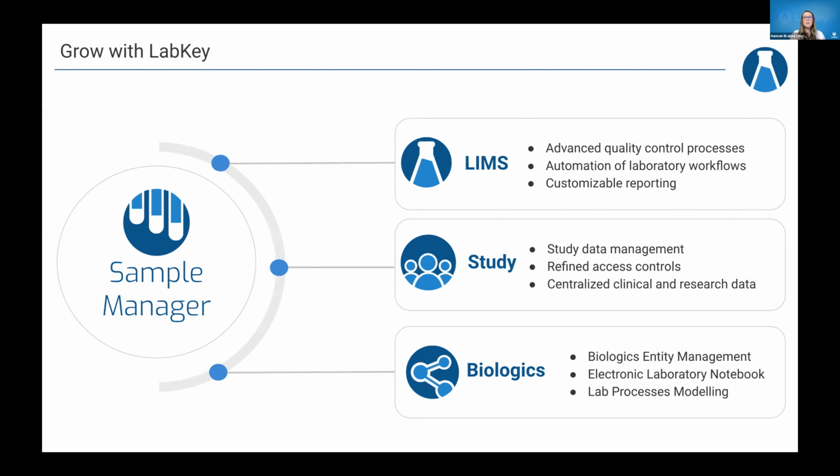So as we start to build out this LabKey LIMS that would allow for those advanced QC processes, automation of workflows, customizable reporting, things like that, bridging that gap, we would imagine some groups really want to use samples, and then as they expand and realize they want more of a full-blown LIMS, they would be able to grow with us within this interface.